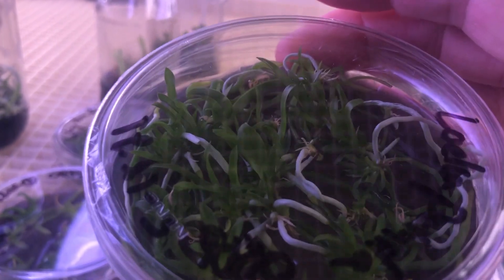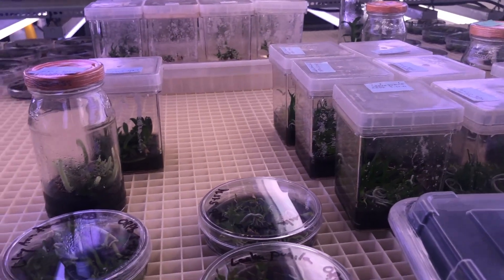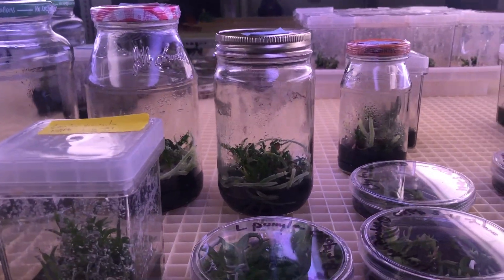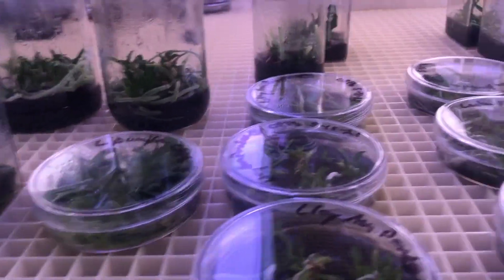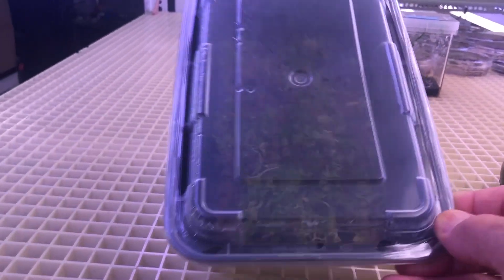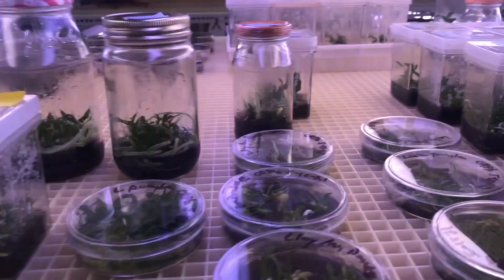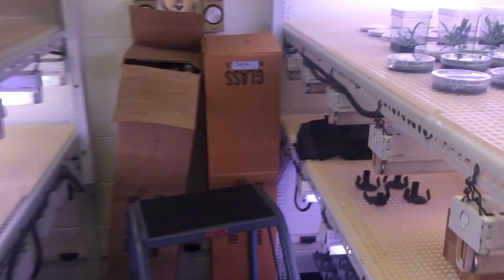This is a Laelia pumila. These are some older plants — just seedlings — and I've got some in petri dishes and in these larger flasks right here. Some of the seedlings are in these larger jars. Here are some of the crosses that I made and some seeds that colleagues have given me. This is just a standard Chinese food container — I've got one here and another one right here. If I have a lot of seed, I can plate the seeds in this container. You have to be very careful with contamination, but you can put a lot of seeds in there.